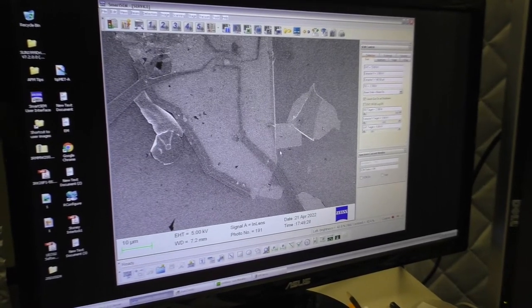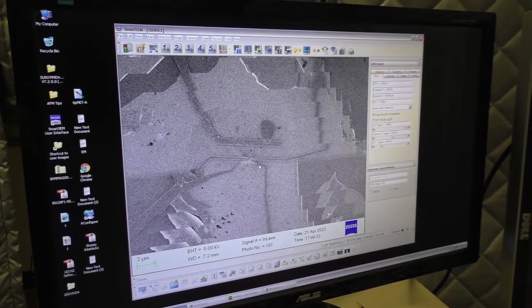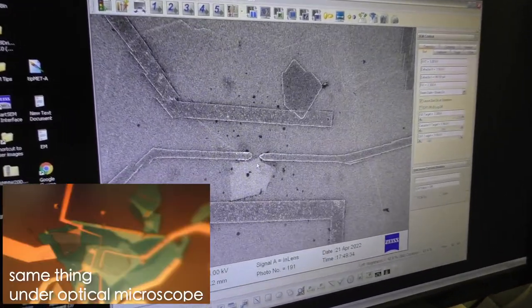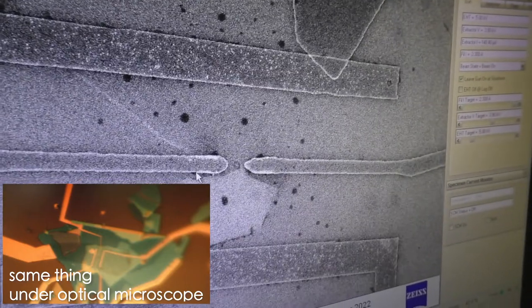We can change the magnification, which is done by changing the area scanned by the electron beam. If we scan a smaller area with our fixed beam width, we get a higher magnification.